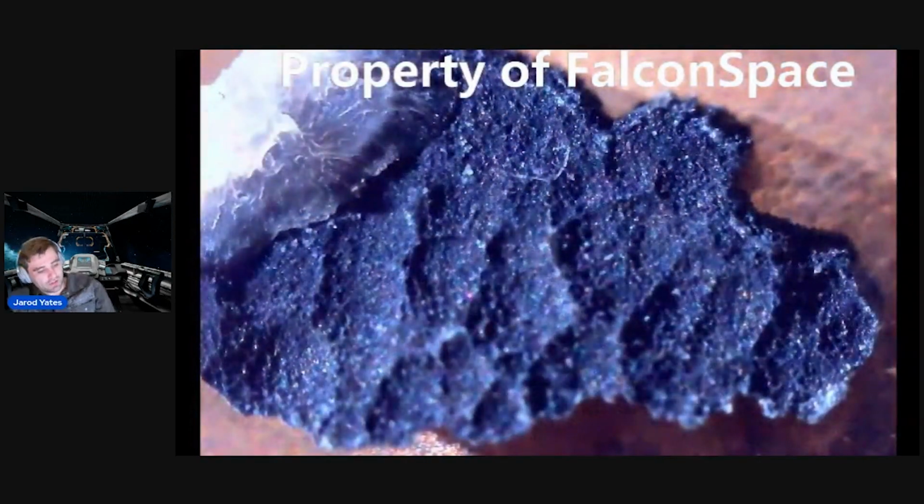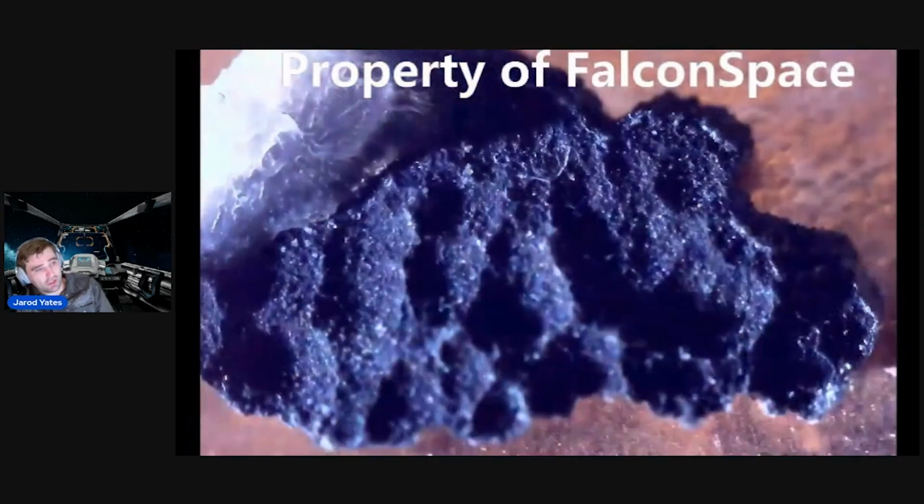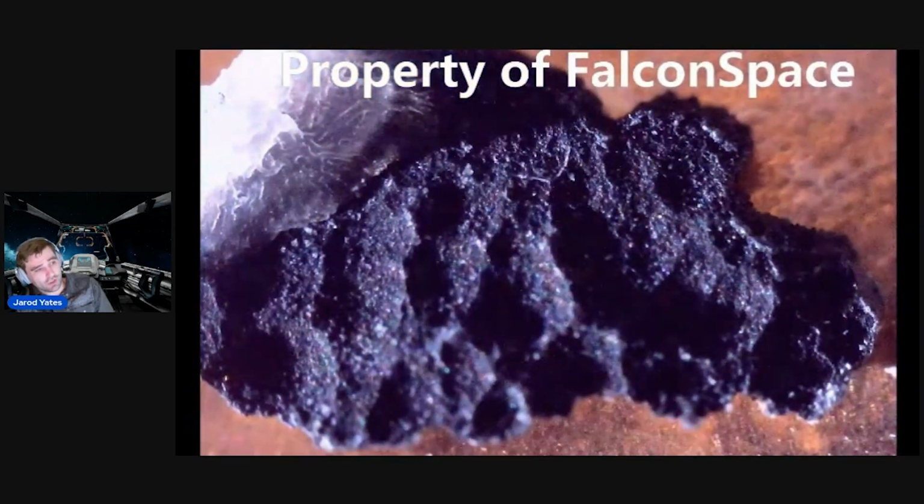Yeah, these beads are super interesting to me. That once again, they might be totally prosaic. We don't know yet. Not until we do the X-ray diffraction, which hopefully will be happening somewhat soon.